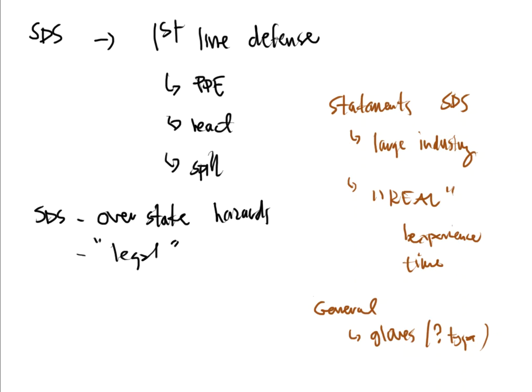So, for example, in the SDS that we talked about in the previous video with water, it basically told us to clean up the spill with an inert material. Well, it never really did tell you what type of material to clean that up with. So they're going to let you make that assumption and that decision. That way, if something happens and you've used the wrong one because it was the decision that you made, well, you can't blame that on the company that provided the SDS, now can you?